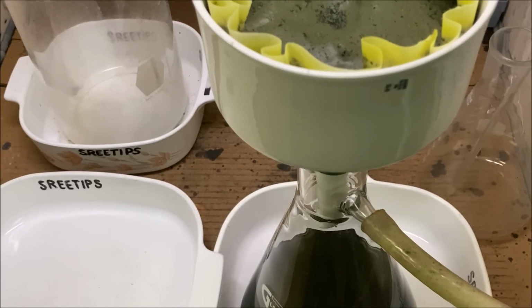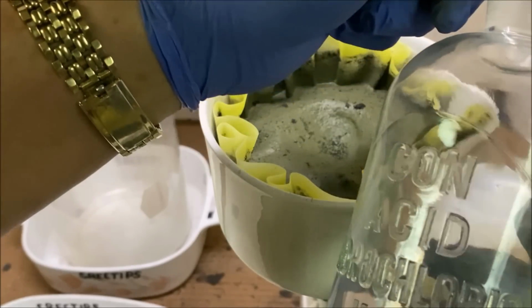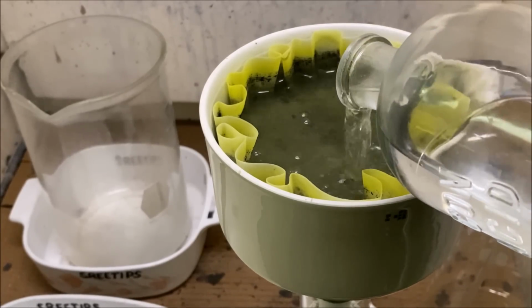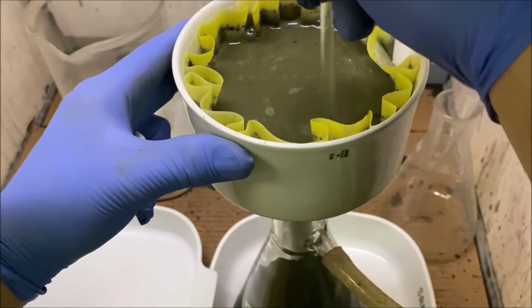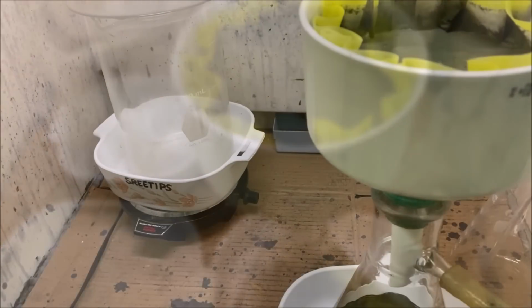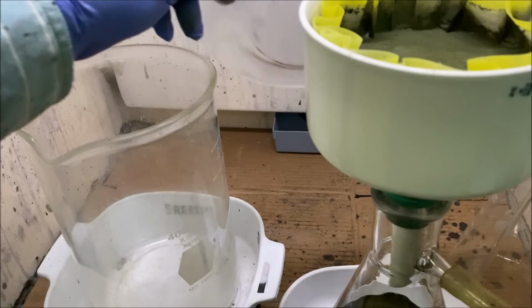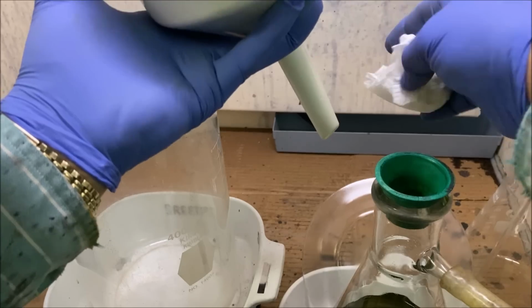Pretty much got it all pulled through almost. Now what I'm going to do is add some hydrochloric acid. Try to rinse some more of the gold out of the solids. I've got all the liquid pulled off of our solids in our funnel up here. So now let's transfer the solids back out of the funnel into this beaker.